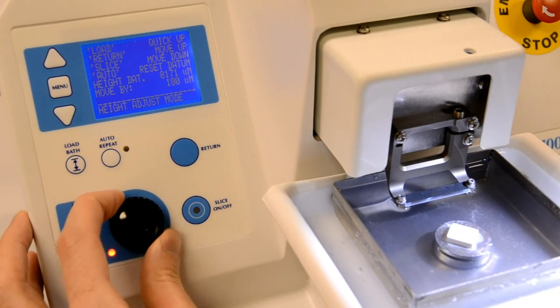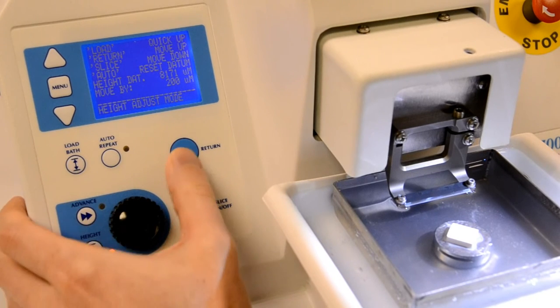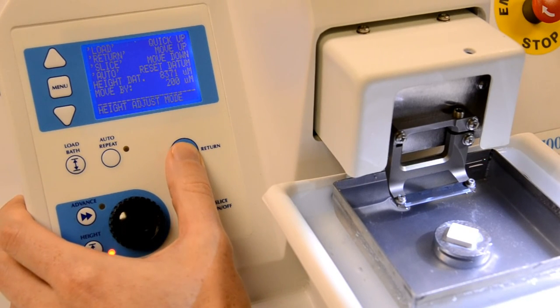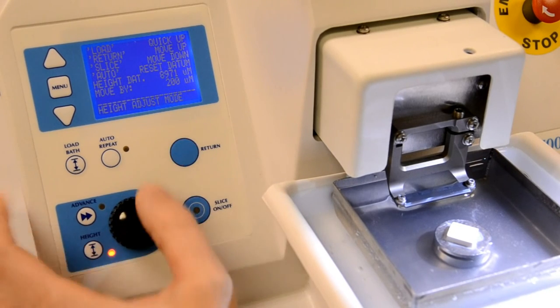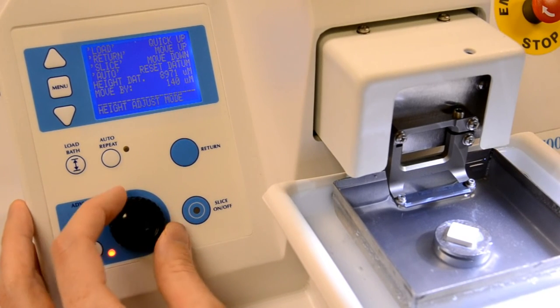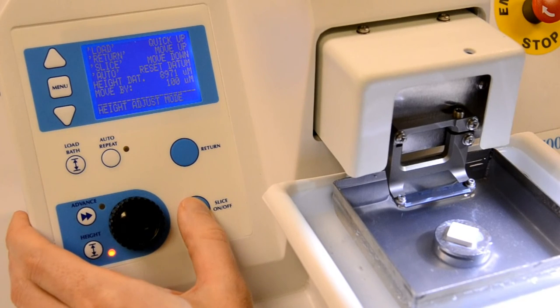Set a movement amount by using the rotary knob and use the return or slice on-off keys to either raise or lower the bath by this amount to move the specimen to a suitable height. You can repeat this as often as you wish until you are satisfied.